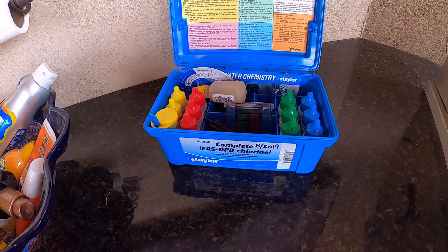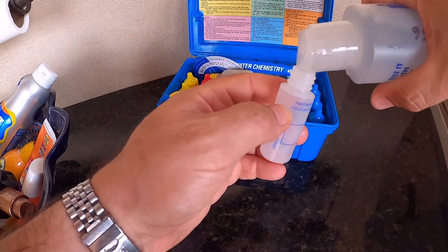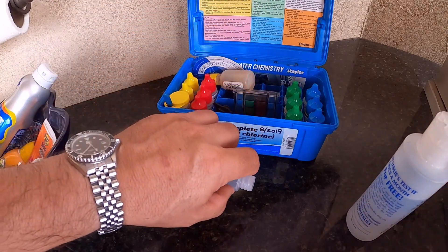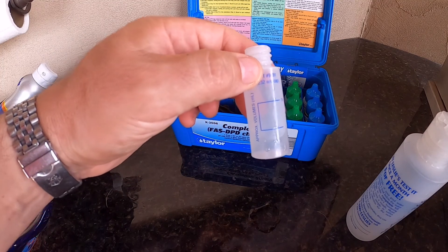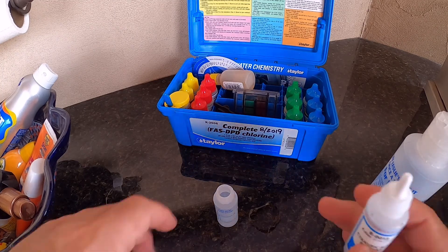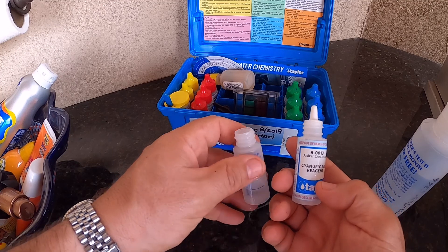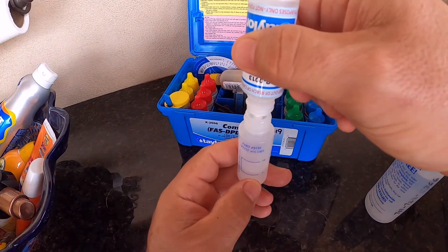I'm going to take my bottle of water from the pool and fill up this small bottle they provide just to the 7 milliliter mark, which is right about there. Then I'm going to take reagent number 13 and fill the rest up to the 14 milliliter mark.